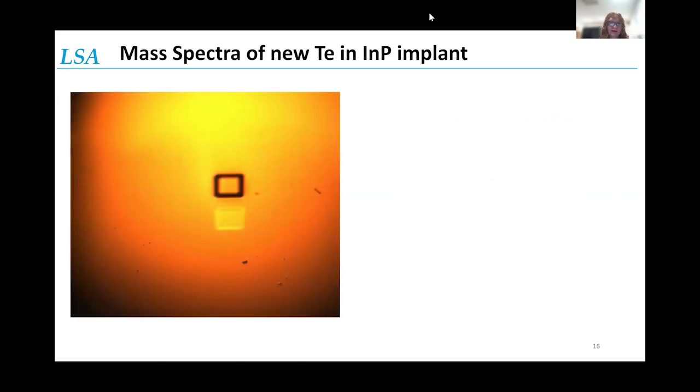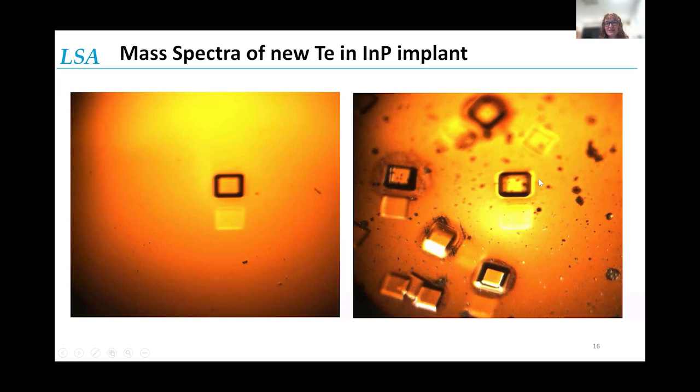When we get implants to begin with, they're nice, clean, shiny sample surfaces. And this is our SIMS crater. But over time, implants start to degrade and they begin to look like this. Lots of craters, going in and out of vacuum, degrades the sample. We get pock marks on it, and this can degrade the quality of the profile that we get. And if we're using this to quantify data, it could bring inaccuracies into the data. So we wouldn't use this.